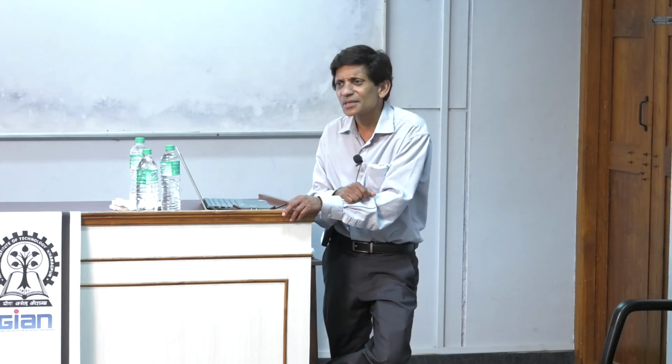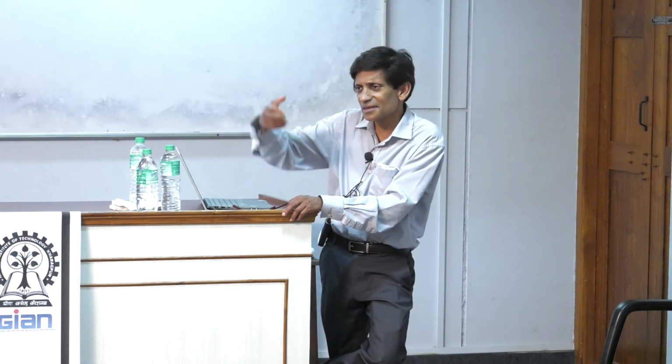Yes, yes. And actually you can design your own, right? Because you just need a diaphragm pump and attach it to a membrane module, and that's all, right? So, yeah, I agree. Okay, should we take a, sorry, go ahead.